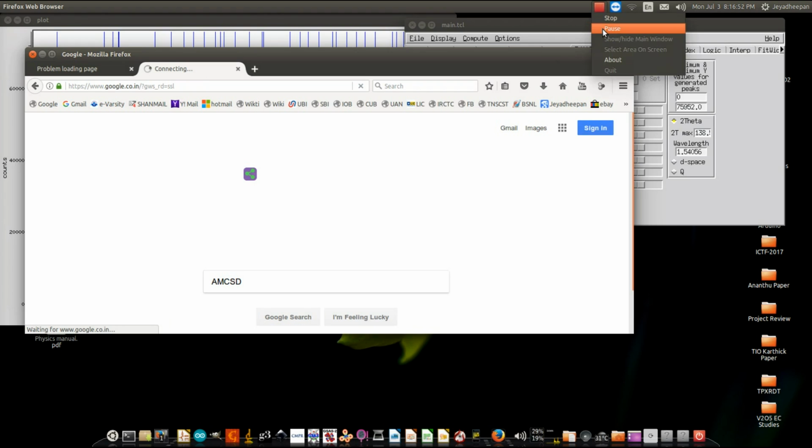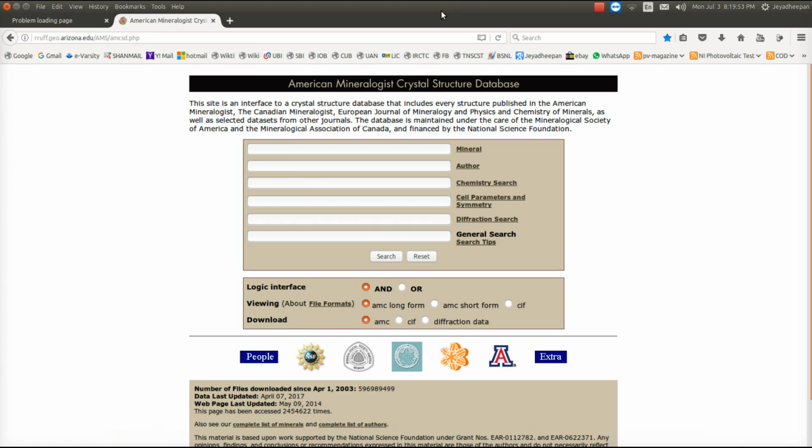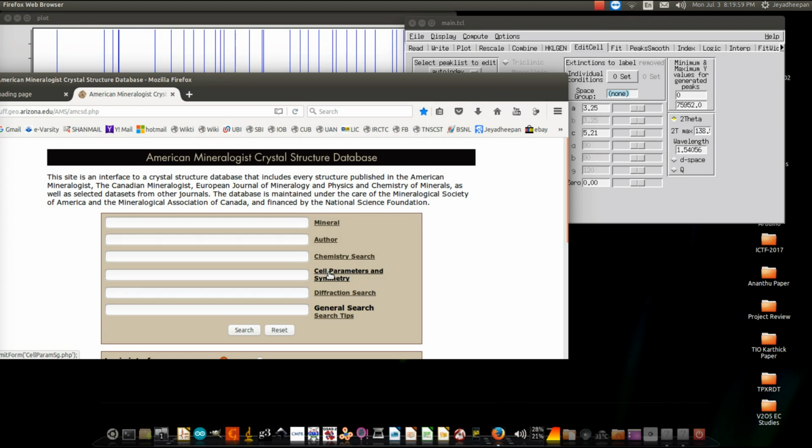It's opening. Yeah, this is the web page. Google for AMCSD.